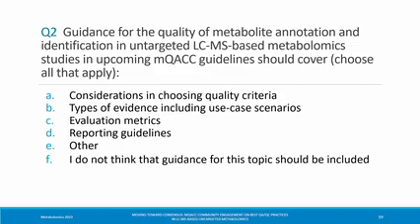All right, so the question that I'm going to ask is, did you share the results? You also, by the way, should be able to see in your phone the results of what you just answered to this question too. All right, so what we want to know regarding in-house libraries, how are your libraries built? So we want to know which standards do you use, how are they measured, collision energies that are chosen, et cetera. So for in-house, specifically MS, or MS to the N libraries, how are they built?